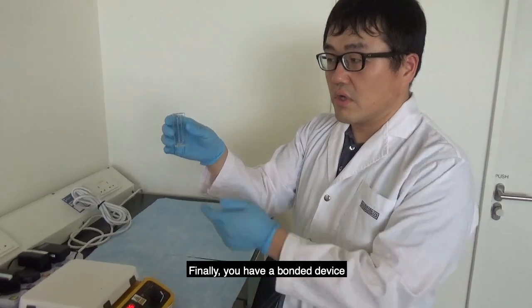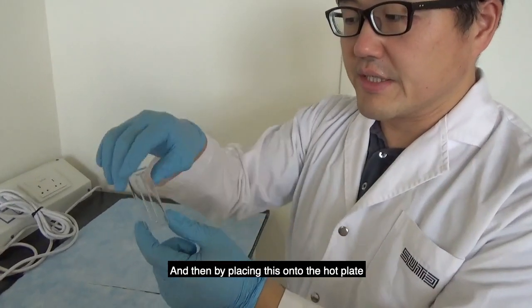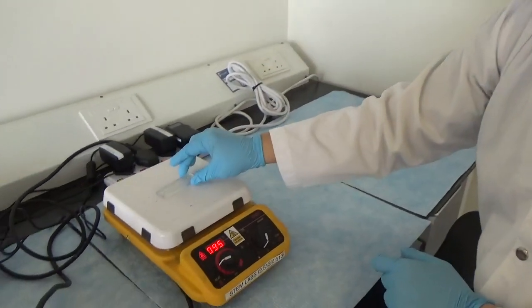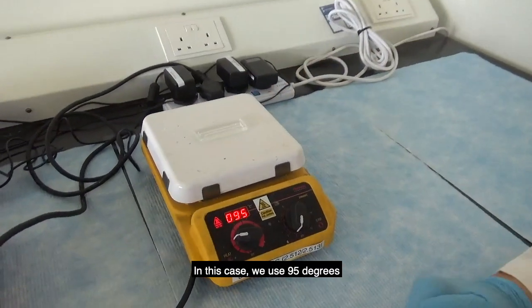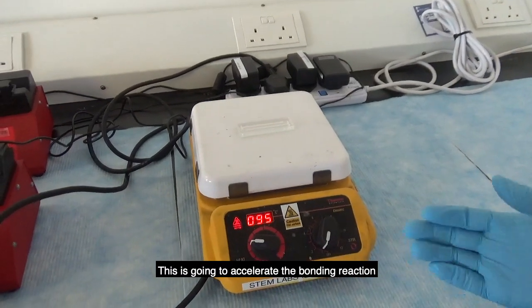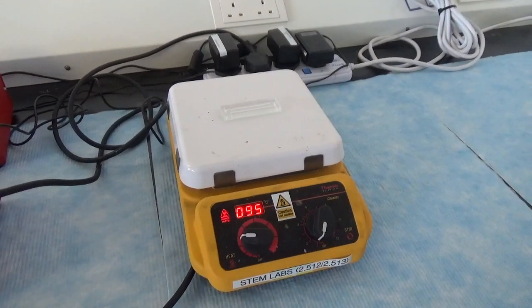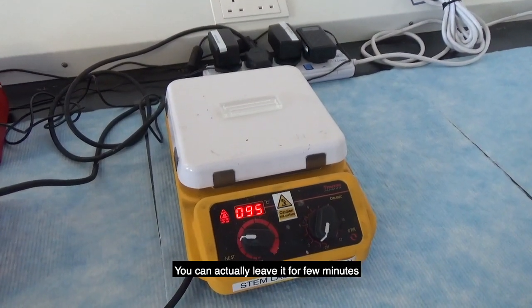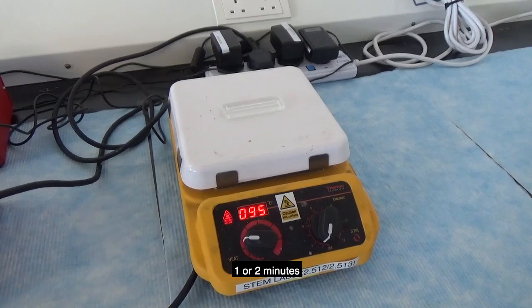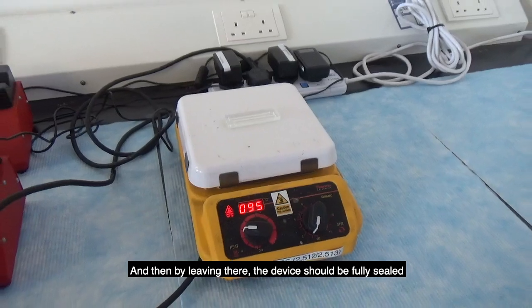Finally, you have a bonded device. Place it onto the hot plate — in this case we used a 95-degree hot plate. This accelerates the bonding reaction between the PDMS and glass. Leave it for one to two minutes, and after that the device should be fully sealed.